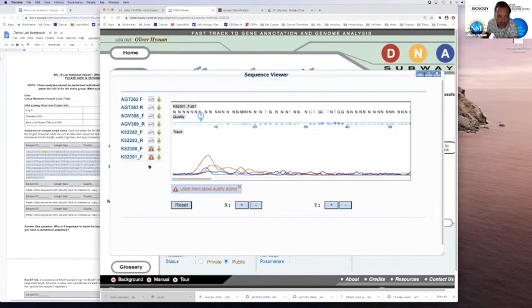So students will sometimes get these warnings in there. Sometimes you'll still be able to analyze the sequences in DNA Subway. So don't feel like you can't use those sequences. You can still analyze the data that you get from those sequences. You just have to take it with a grain of salt, understanding that you can't necessarily trust those sequences.